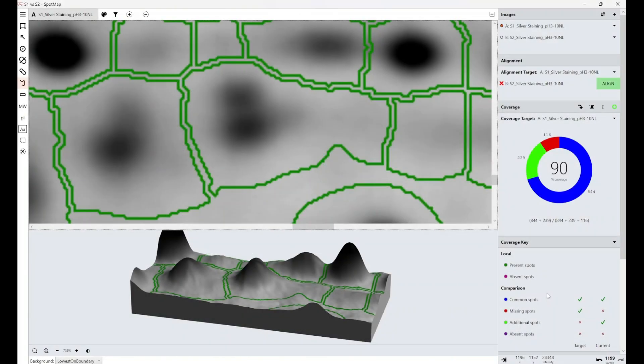Hello everyone. So today I'm going to be guiding you through the manual spot splitting tool that we've got built into our SpotMap software.